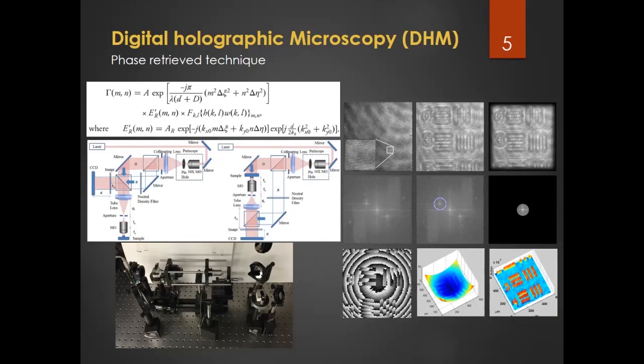However, the traditional setup of digital holographic microscopy always has spherical aberrations that need to be cancelled out. The phase aberration has to be cancelled out. Usually we do manual segmentation of the background and do a Zernike fitting to get the phase.